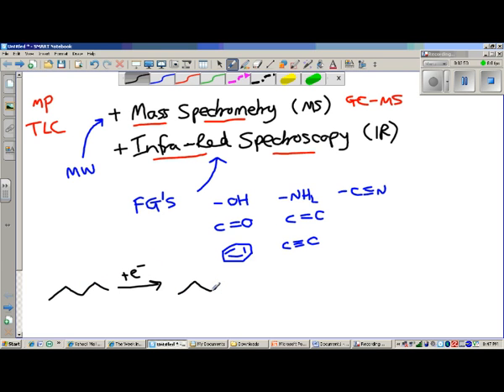And so what you get left with is a highly reactive species that's missing an electron. So it's a radical species because it's missing an electron. It's also a cationic species because it's got one electron less. Very, very unstable species, and so therefore doesn't last very long. And then this breaks down, or fragments, into smaller fragments. Might look something like this.